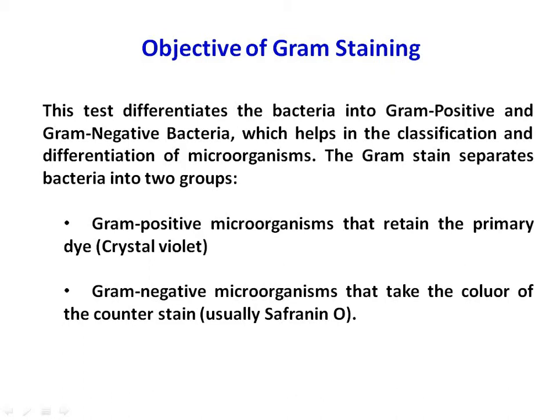This procedure is called gram staining technique. In this technique, a thin smear of bacterium is prepared on a glass slide. To the smear, crystal violet solution is applied. The slide is then gently rinsed with clean water and an iodine solution is applied.